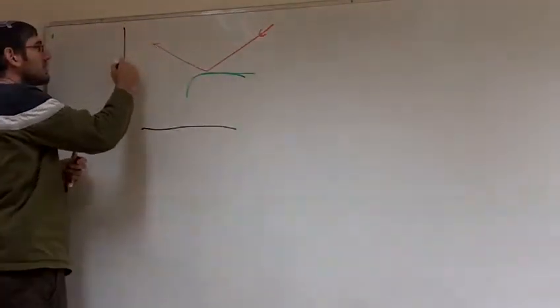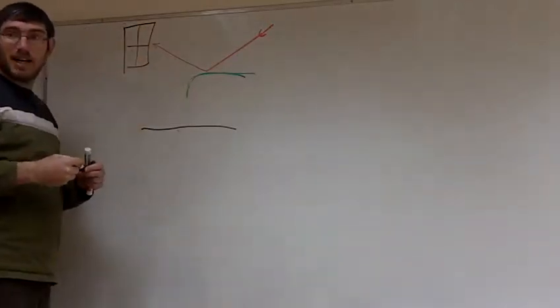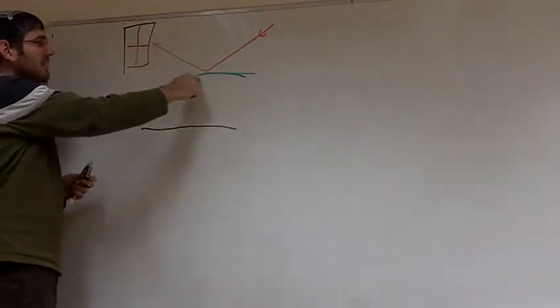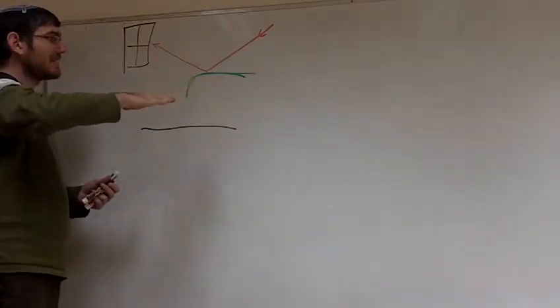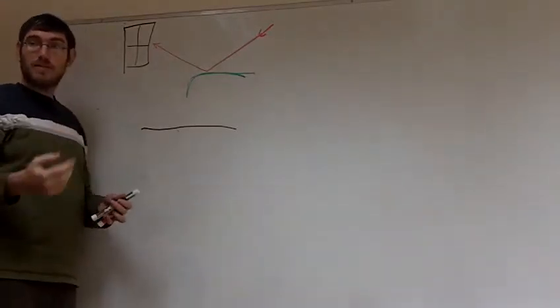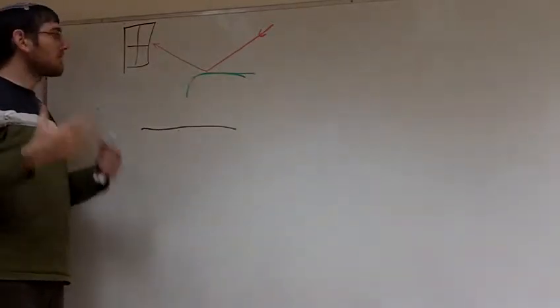This detector we call a PSD, the photosensitive diode. So the laser hits this detector, and then when the tip is in contact with the surface, mechanically something happens to the tip. So we have two modes. In the MV1000, we have contact mode and we have intermittent mode. So let's start with the contact mode.